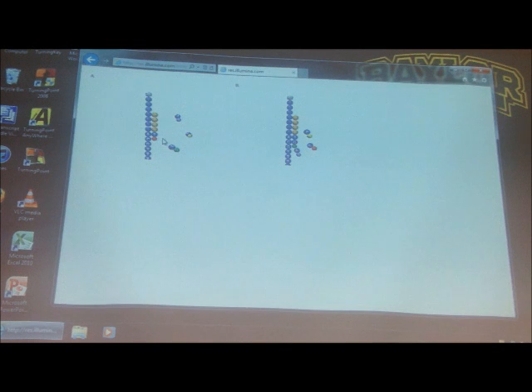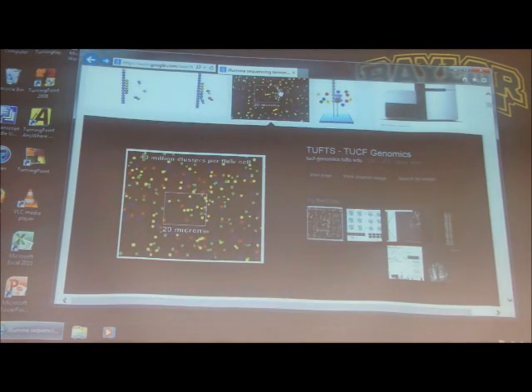Then you have a reaction where the fluor is cut off. And then we're ready to add the next one. And then the next one comes in, and it gives a specific color. And because of that, you wind up with all these little different patches giving different colors. And so the computer keeps track of which patch is which, and which color is coming out at that particular time. Well, that one's yellow this time, and then we flush, we degrade the fluor, and then this one is green now, and it keeps track and is able to do each one. Okay? So that's basically that.